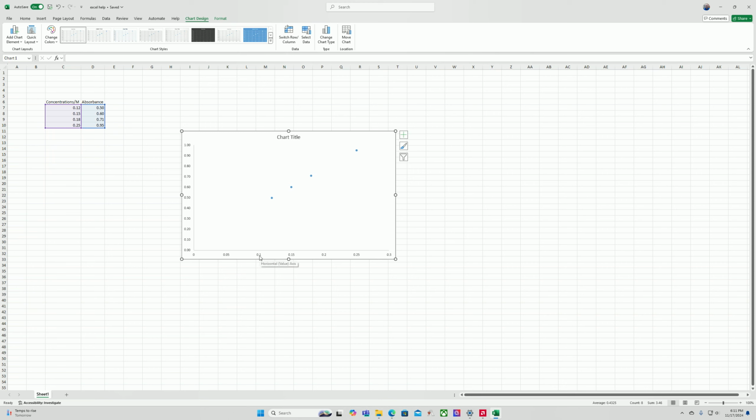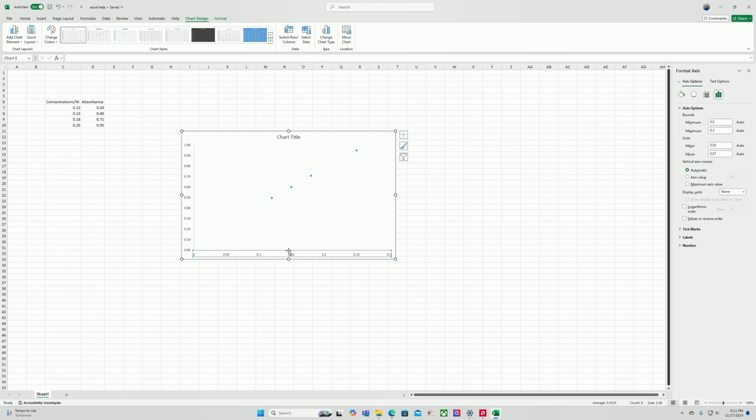And so what I'm going to do to focus in on the main points of my graph is double click on this axis. This is the x-axis down here. It brings up this little chart. My first point starts at 0.12, so I give myself a little bit of room, but I'm going to start it at 0.1, and now you can see there's a lot less dead space on this side. In fact, you could probably go out a little bit further, depending on how picky you wanted to be. That's a decent amount. If you were just really good about it and started it there, that would be okay too.